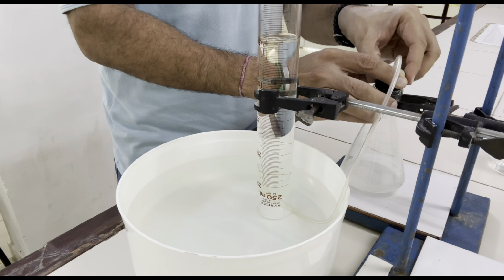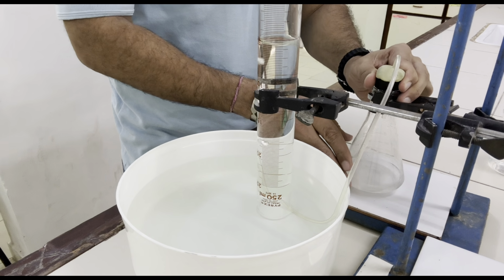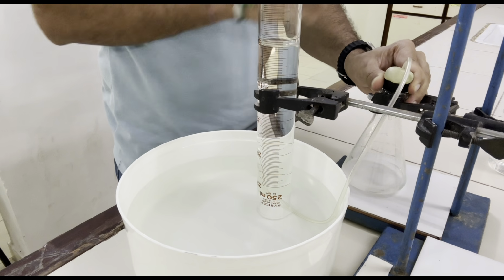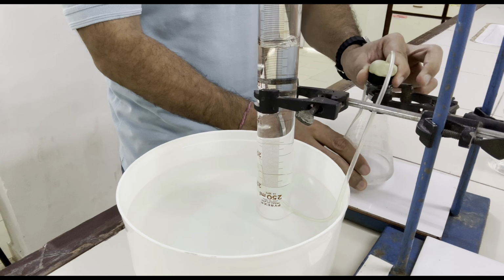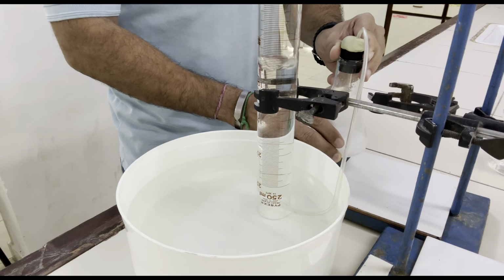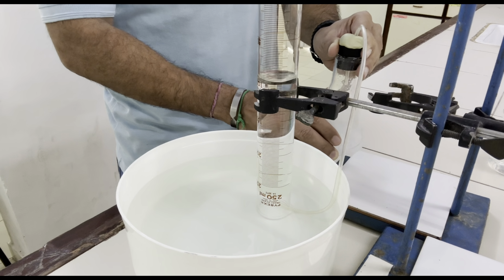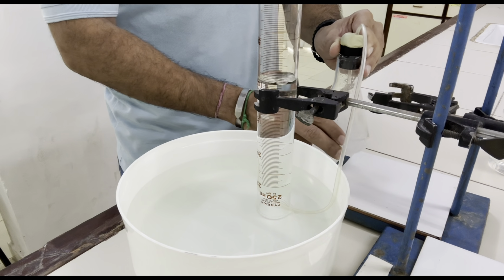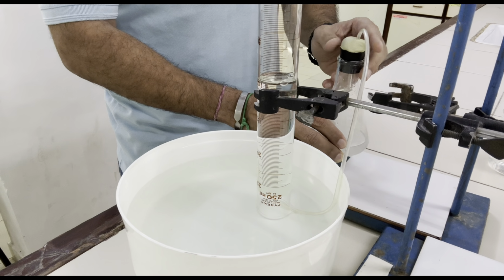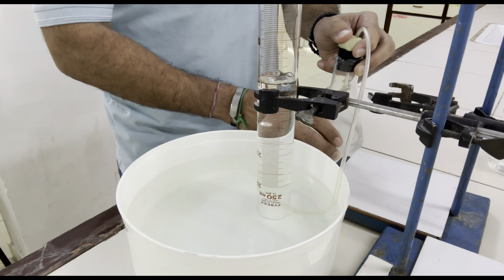Now the question has said remove the flask and stir occasionally. So let me open this clamp and remove the flask from the clamp and stir occasionally, and we can see the gas is continuously coming up. We will wait until the whole reaction gets completed and the maximum gas is collected.